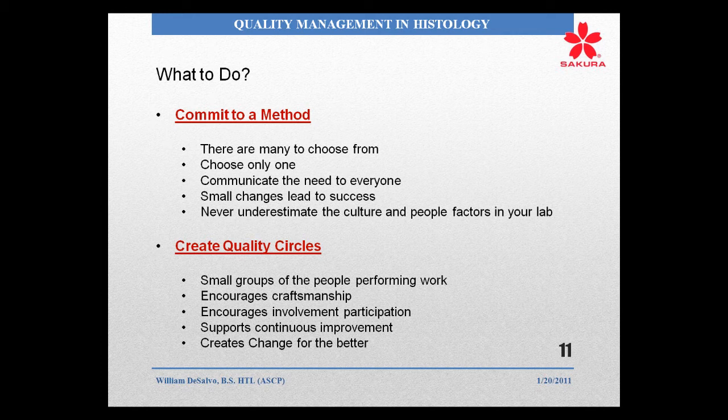One of the things that I suggest is trying to create what is commonly known as quality circles. It's small groups of people who perform the work. So if it's histotechs who are doing microtomy, there needs to be a quality circle around microtomy. They're the ones performing the work. They're the ones who know whether or not your procedures actually are stating what they're doing each and every day.